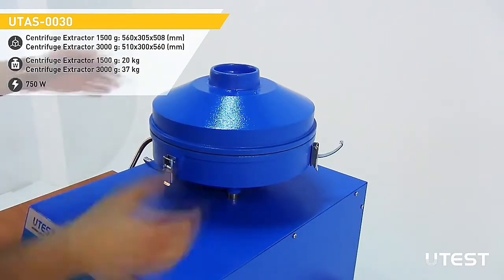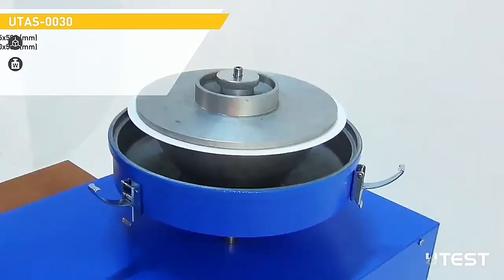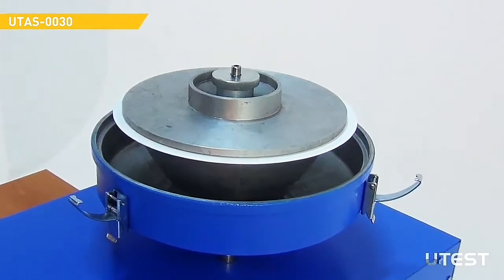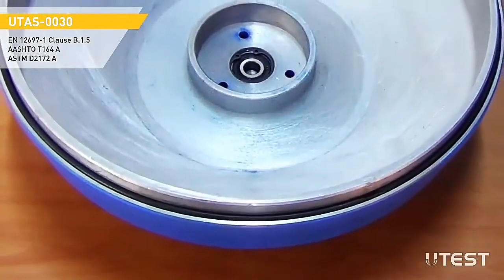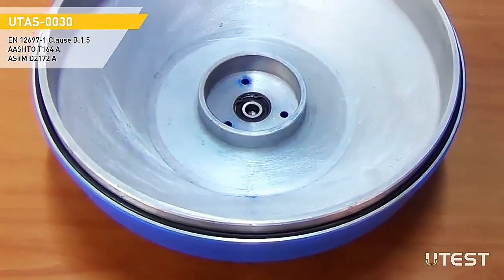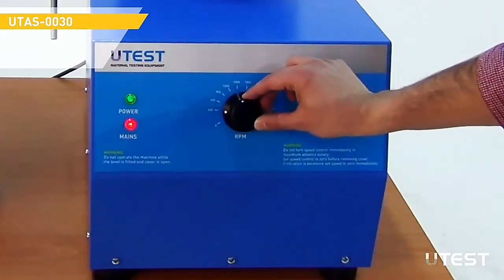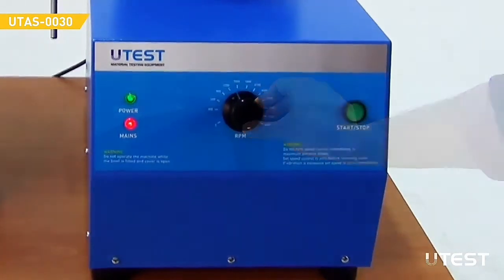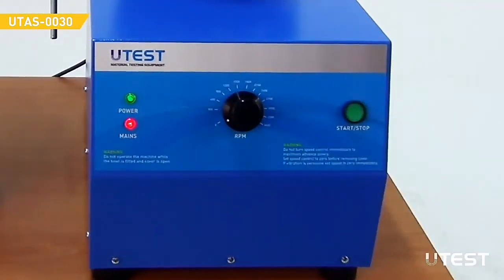Both models consist of a precisely machined, removable aluminum ball with cover. The cover is fitted with a solvent-resistant gasket to avoid leakages. The ball is driven by an electric motor, and the motor speed can be adjusted up to 3600 RPM.